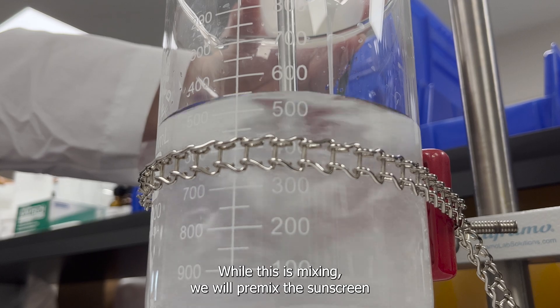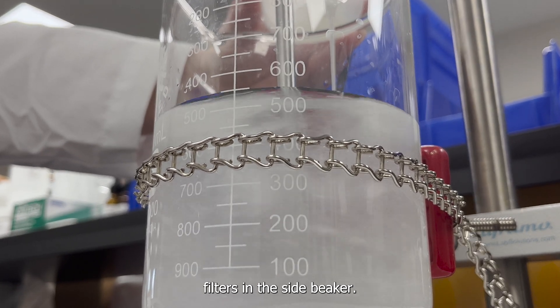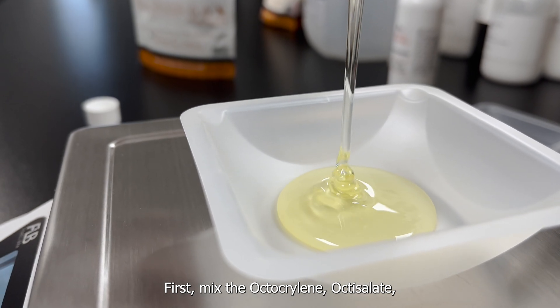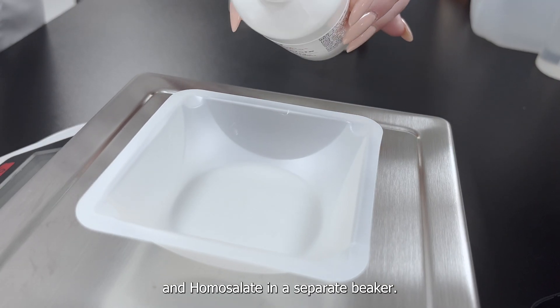While this is mixing we will premix the sunscreen filters in a side beaker. First mix the octocrylene, octisalate, and homosalate.